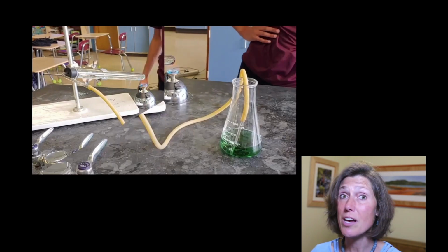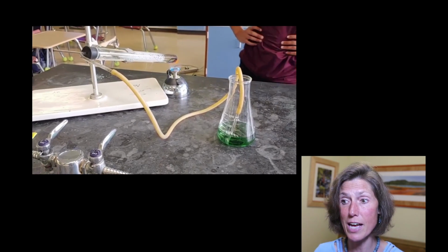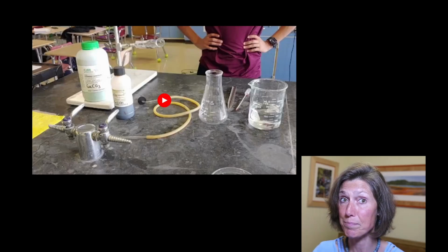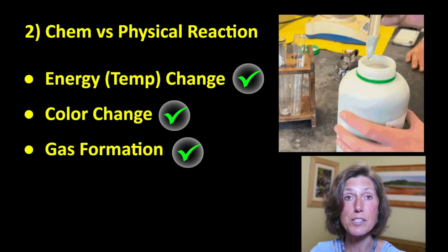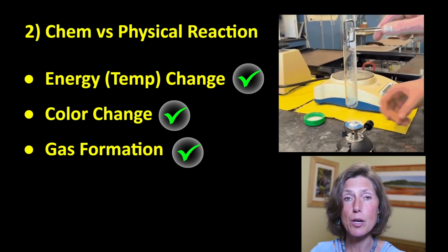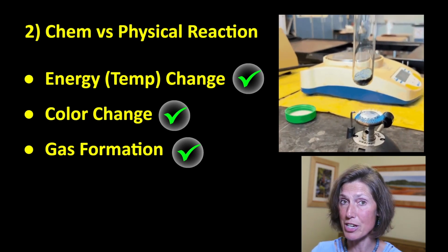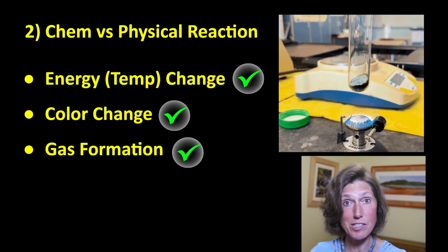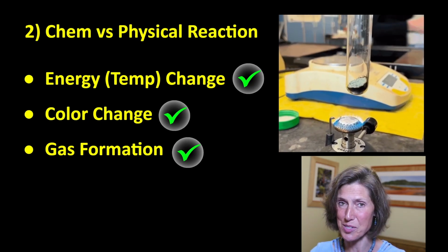Different setup here, same reaction. We're siphoning off the gas. It's released in this flask. Clearly there's bubbling. Based on these 3 observations combined, we can confirm that this is a chemical reaction. We are not seeing a frequently observed 4th type of evidence, namely the formation of a precipitate, but since this is not a double replacement reaction, there is no liquid in sight at this moment.